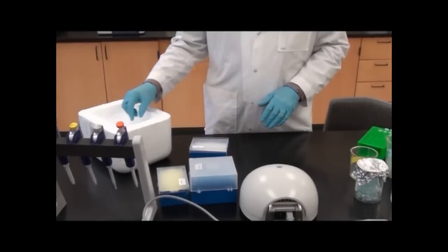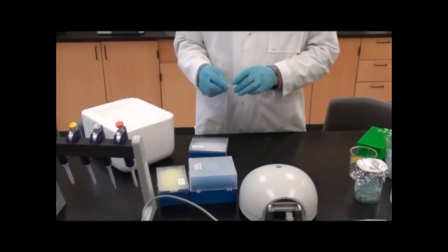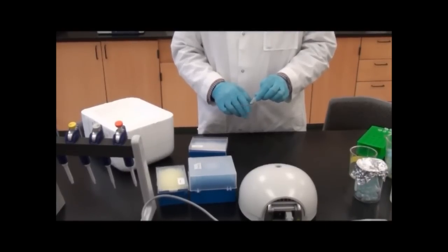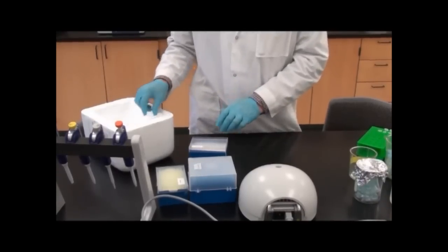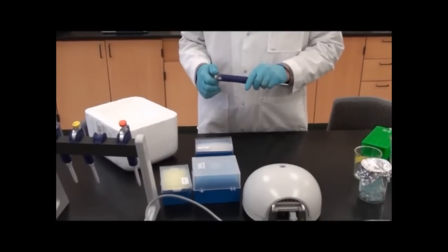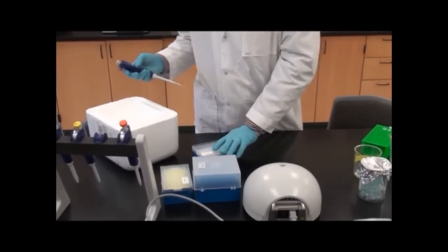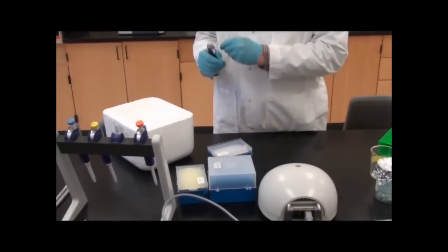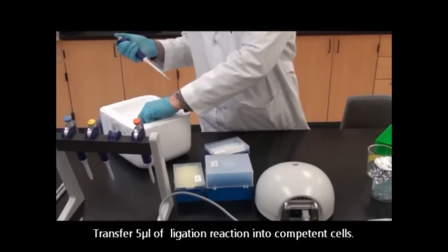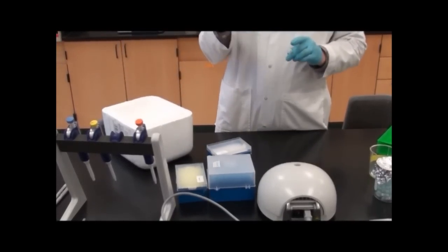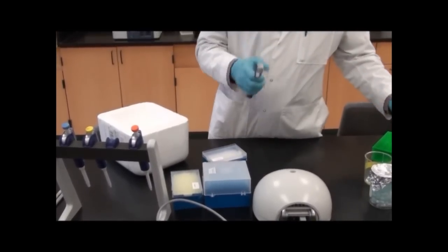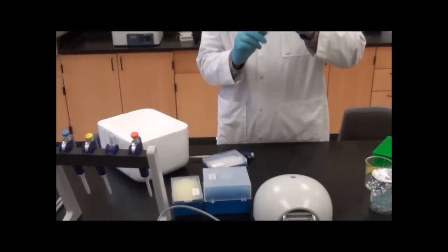Now we've allowed our cells to thaw a little bit. I can tell they're thawed by flicking and seeing that the liquid's moving. What I want to do is transfer my ligation reaction into the competent cells. I'm going to take about 5 microliters of my ligation reaction and transfer it into my competent cells.